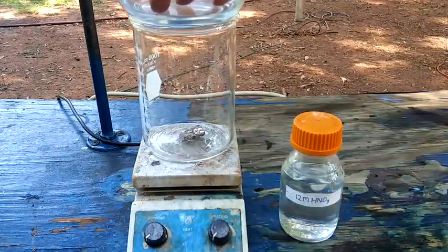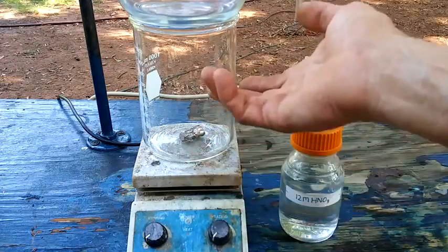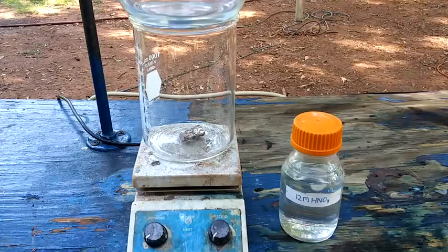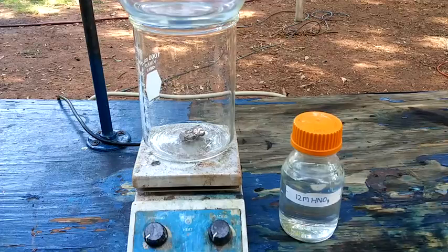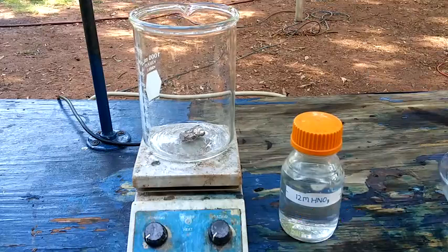Put some ice in this so that as the nitrogen dioxide comes up with the water vapor, it will condense and drip back down as nitric acid. So your process will be a little more efficient, actually a lot more efficient. And so that's what we're doing here. So I'm going to go ahead and get started.